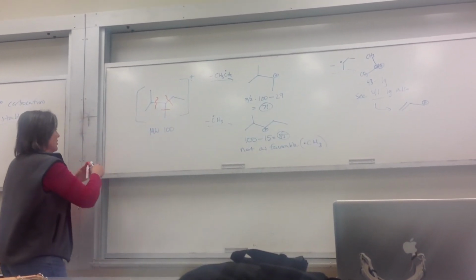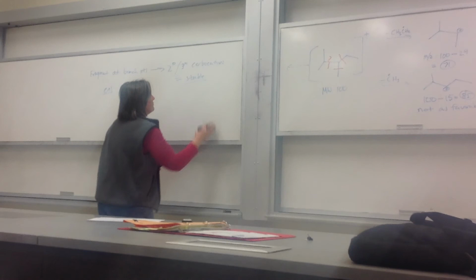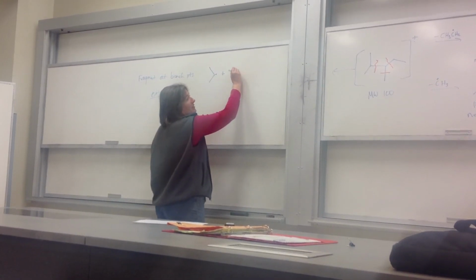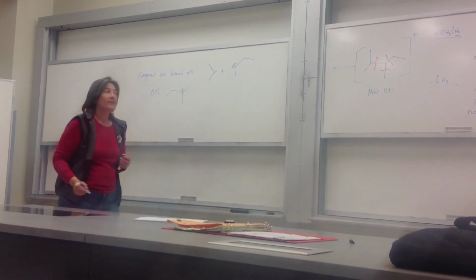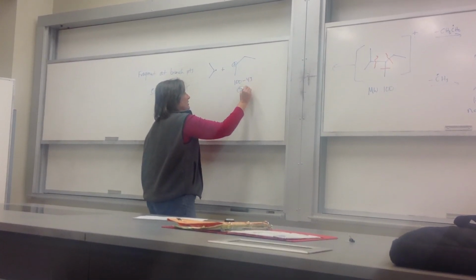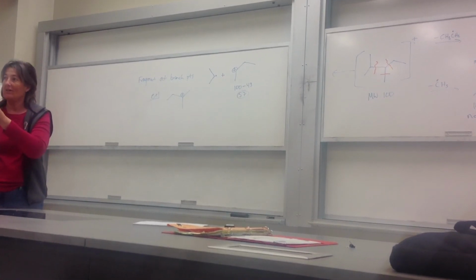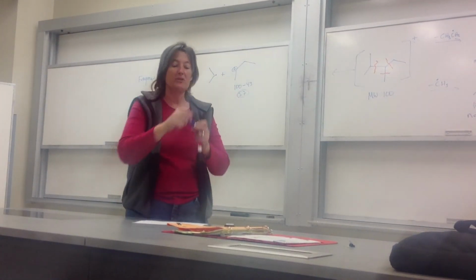I could have done, let's go backwards this way with it. I could have taken off that isopropyl as a radical, and I wouldn't see it in that case. I could have done like that, and this. So this piece, the carbocation at 4, that'd be 100 minus 43, 57. And it's that big peak right there, 57. And then there's clusters around it where it's starting to lose hydrogens and different things. But we do see something at 57 with a grouping around it.